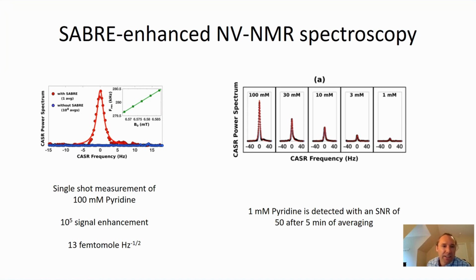In general, all these techniques, be it NV-NMR, ZULF-NMR, or any other way of detecting NMR, will profit greatly from these types of hyperpolarization techniques.